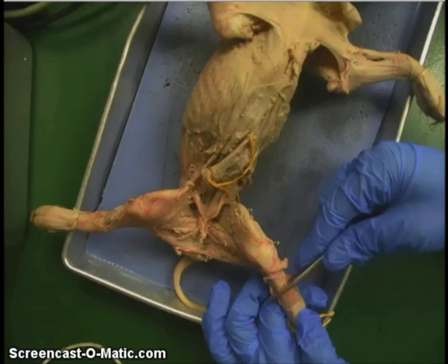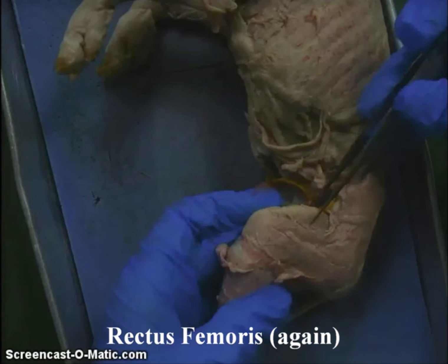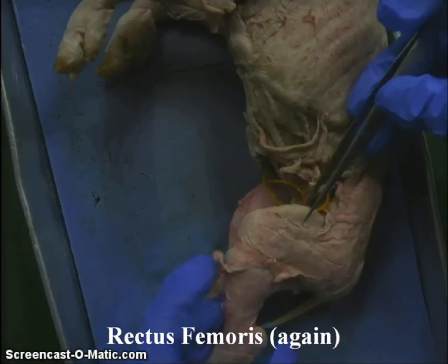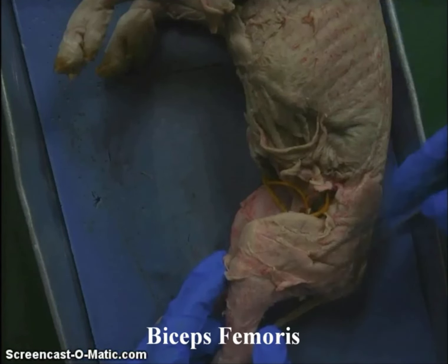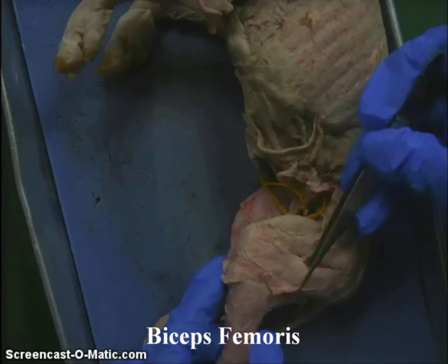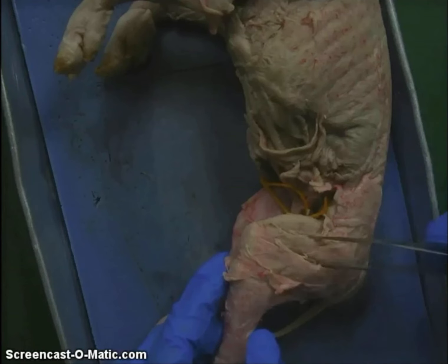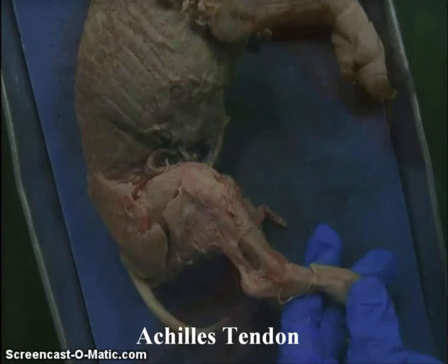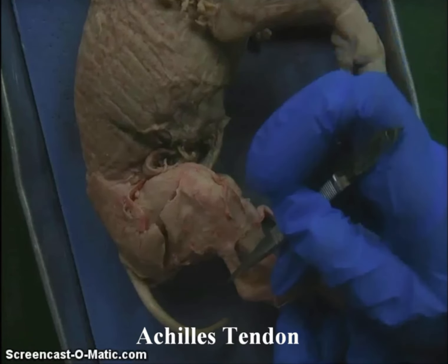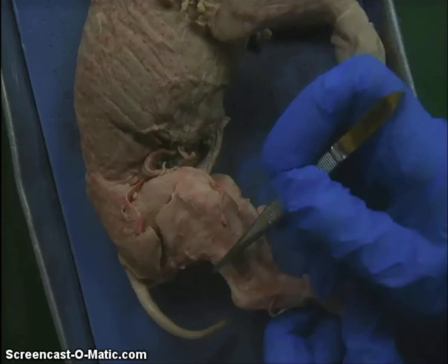Now if we look on the other side of the pig's leg, you can see the rectus femoris again. This is just a different view of it. And then we have the biceps femoris, which is this really big muscle right there. Above that, but below the rectus femoris, is the vastus lateralis, because we're looking at the lateral side of the leg. Down there is the Achilles tendon, and above it there's the gastrocnemius and the soleus.